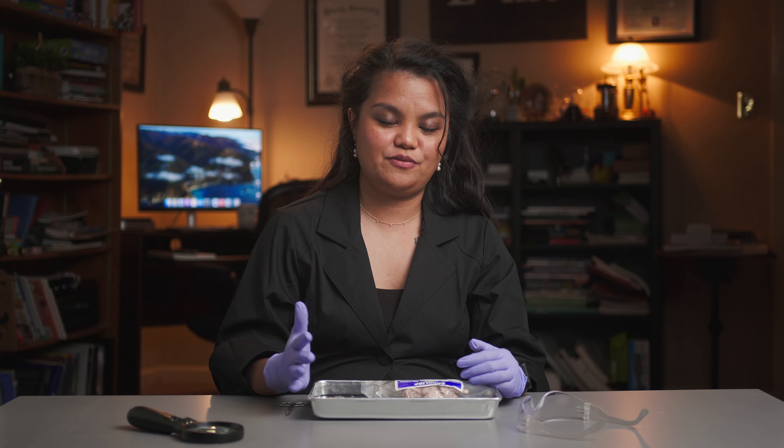In today's episode, we are going to do a dissection activity with a sheep brain. Our goal is that after watching this video, you will be able to identify each part of the mammal's brain and describe all their functions.